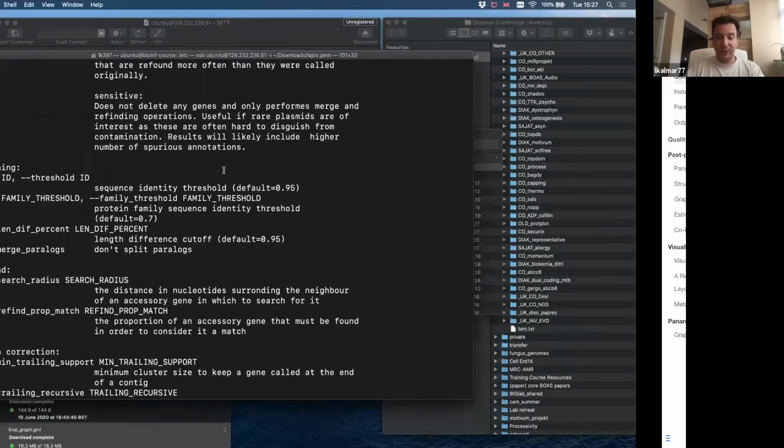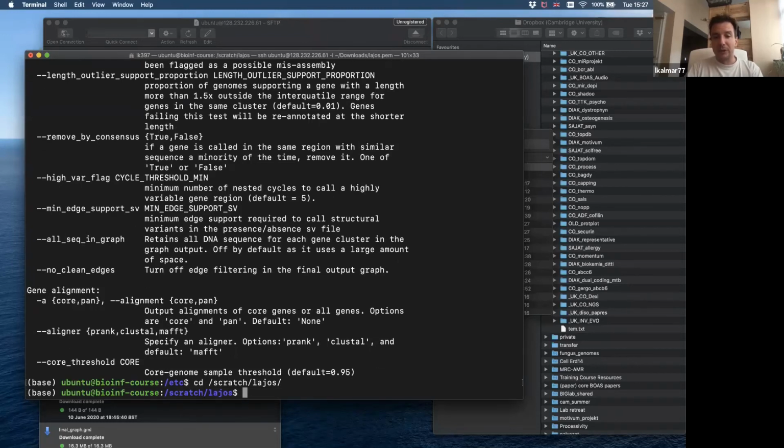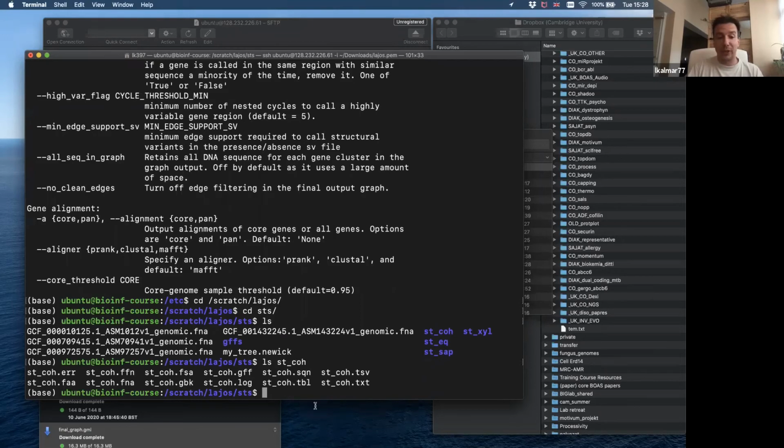As you remember, when we did the Prokka annotations, these folders for me, they are all the main outputs of Prokka. So this is what you get back from a Prokka annotation. You get back an FAA file where you have the protein sequences for all predicted genes. You have a GBK file, which is the GenBank format annotation. You have the FNA, which is just a nucleotide FASTA file. And you always have the GFF file.